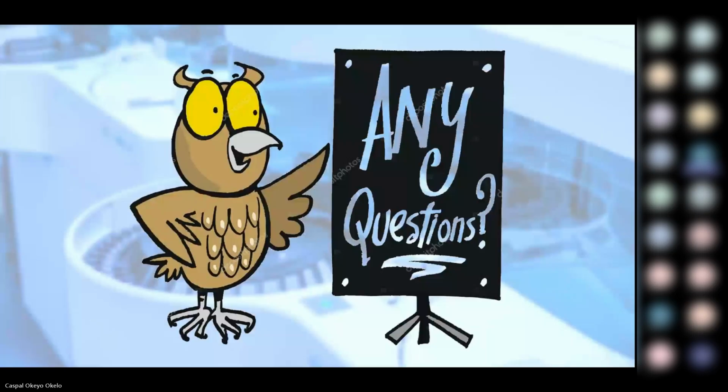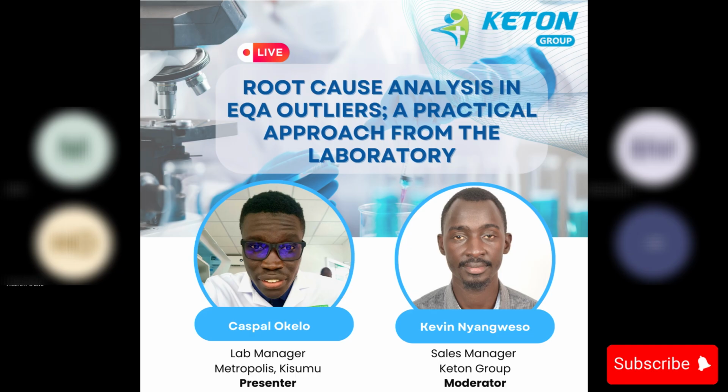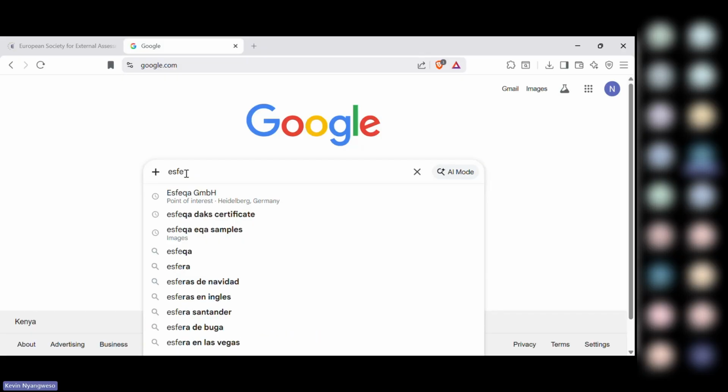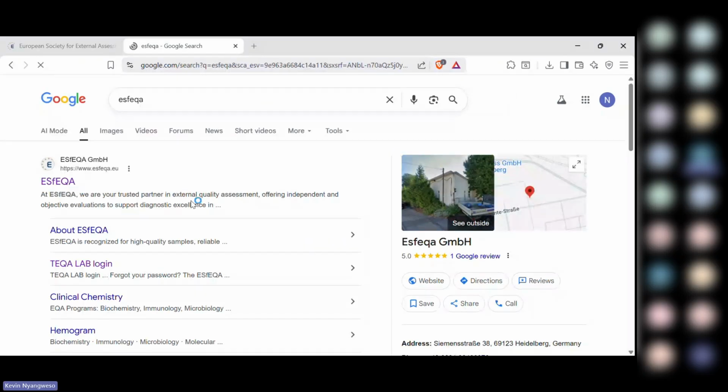And I wanted to show you how you can review the EQA programs that we have and the panels that we are able to offer. So allow me to share my screen a bit, Caspal, and then we go to the questions in a minute. When you go to Google, the EQA material that we supply is from the European Society for EQA, in short ESF EQA. So you can just search ESF EQA.